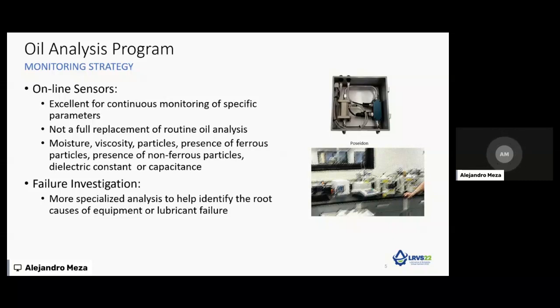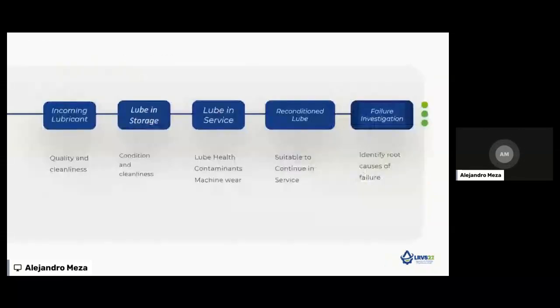So we have mentioned so far different resources, and let me add one more to this broader perspective of lubricant analysis. In this illustration, we see the lubricant life cycle in the facility or the fleet. We receive a new lubricant, it goes through storage and handling, application, and lubricant in service. Sometimes we are able to recondition the lubricant, filter it, dehydrate or sweeten it to continue the use.